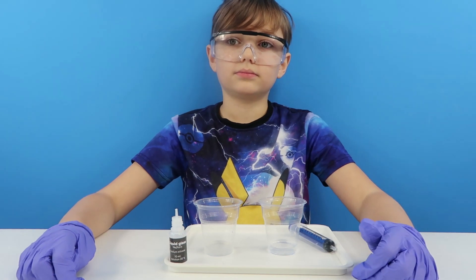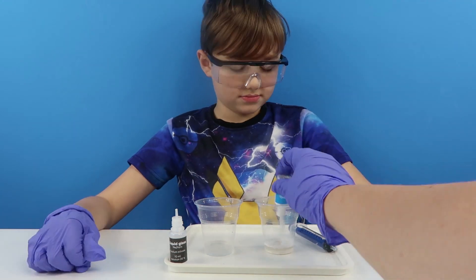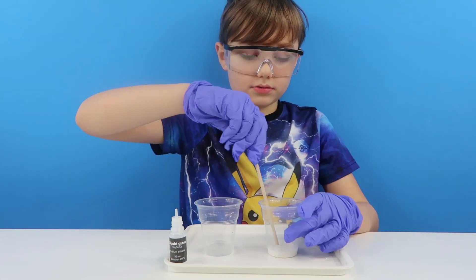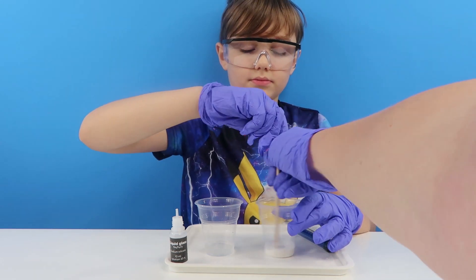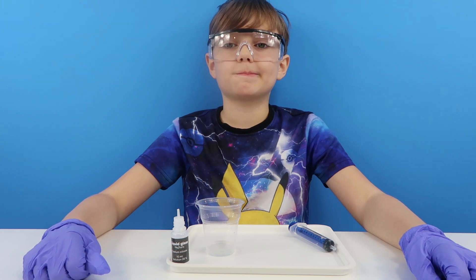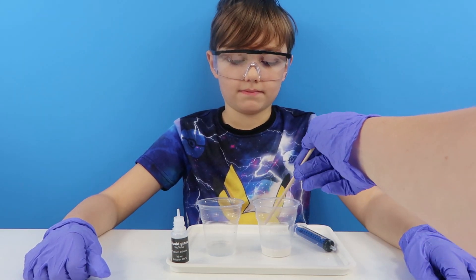So the entire bottle of this please. Stir it for 30 seconds. Right. Now what we're going to do is we're going to pour one of those into the other.